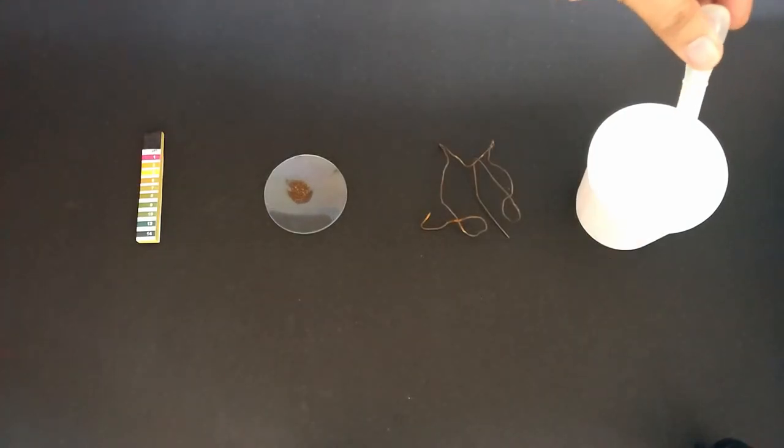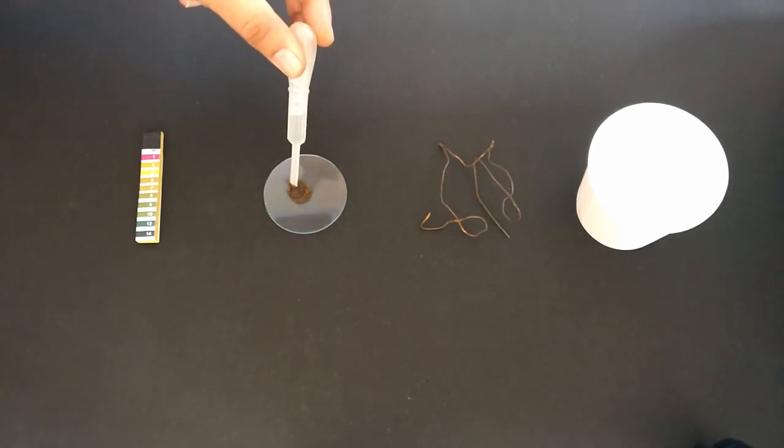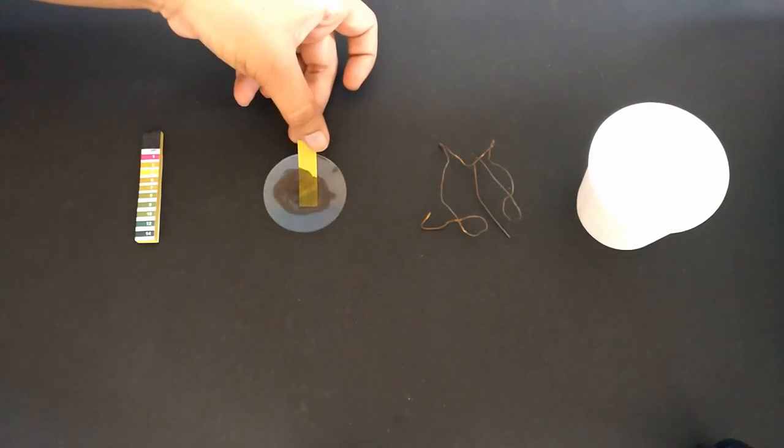Mix a few drops of water to the sample of rust you have collected. Dip the pH paper in the rust water and observe the changes it undergoes.